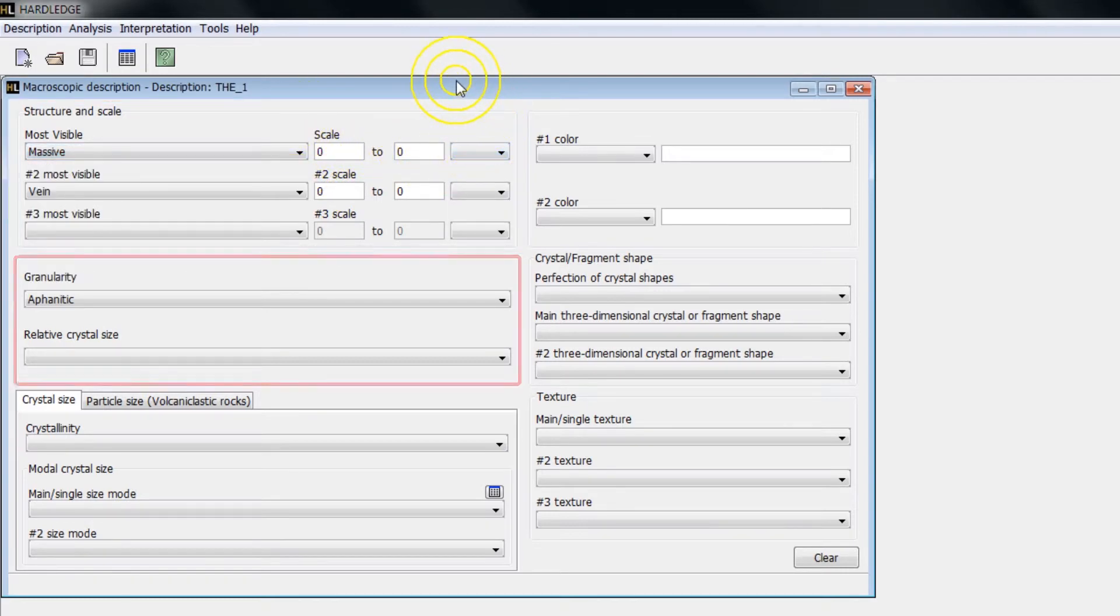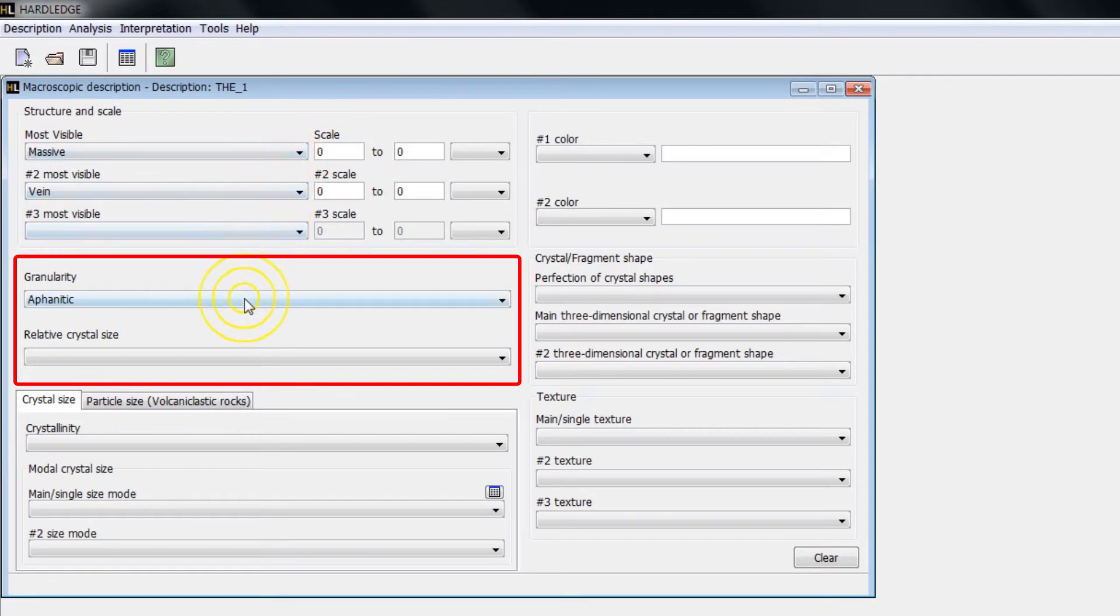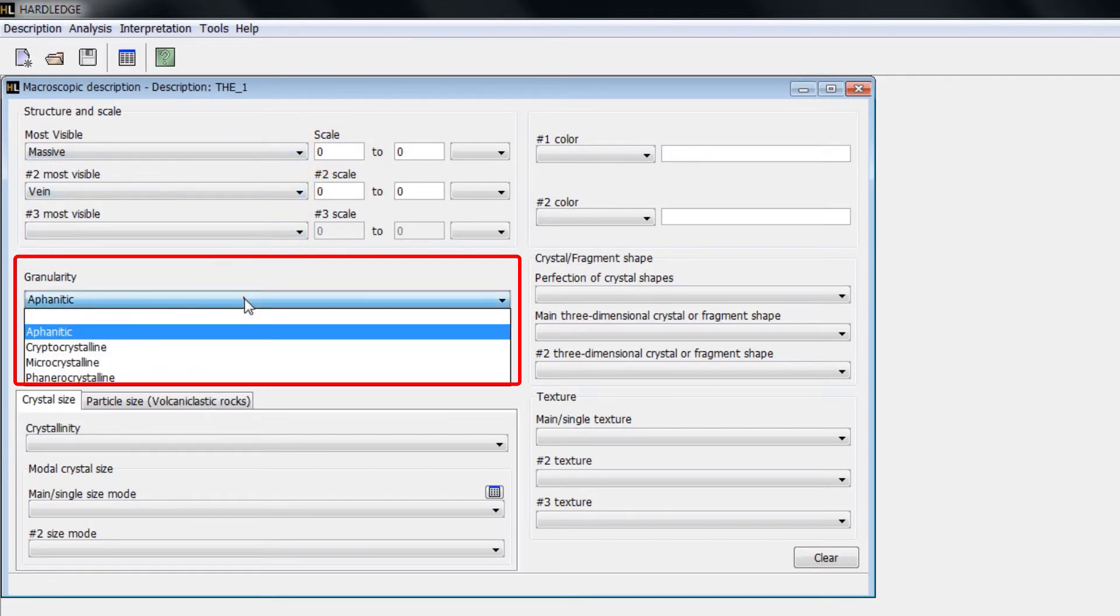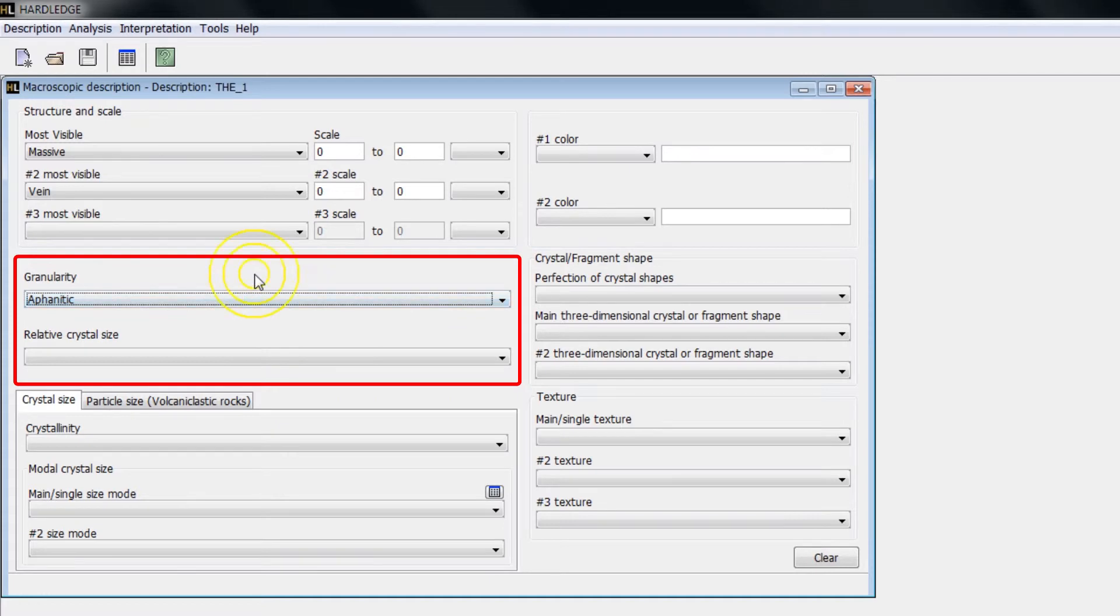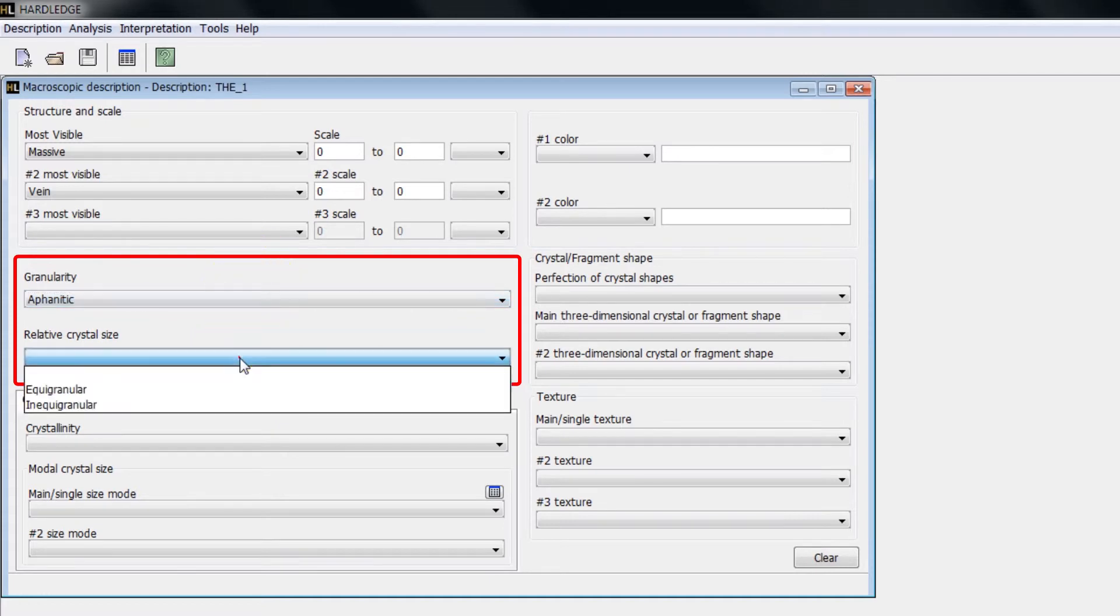In Granularity, you can inform if the crystals are visible or not macroscopically. In Relative Crystal Size, you can inform if the crystals are or not of the same size.